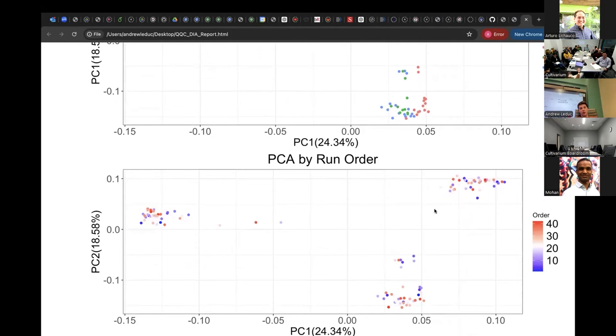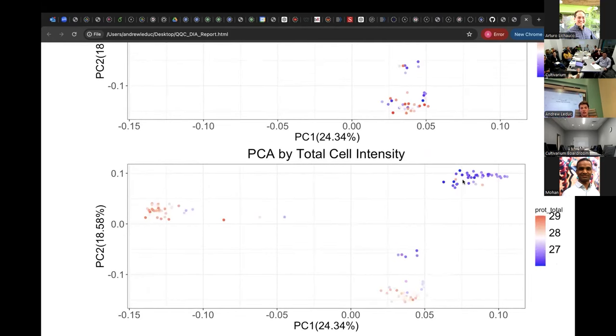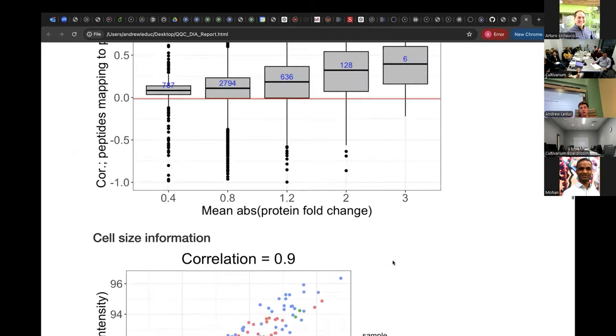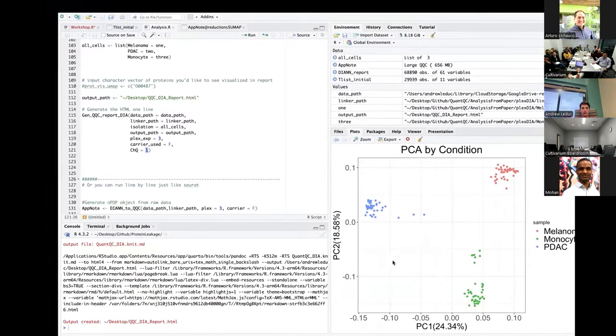I will talk a little bit about a step we took to do some batch correction here, but if something happens in the LC, you will sometimes see some signal, but it's pretty easily correctable. You can look at the total cell intensity. I think these are actually the monocytes, which are the smallest ones that we analyzed, and I think these PDAC cells we had were the biggest ones, and somewhere in the middle here. So these are just some things that you might be interested in getting a quick glance of.